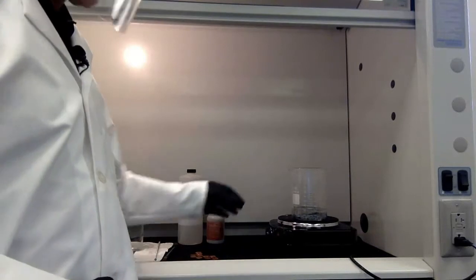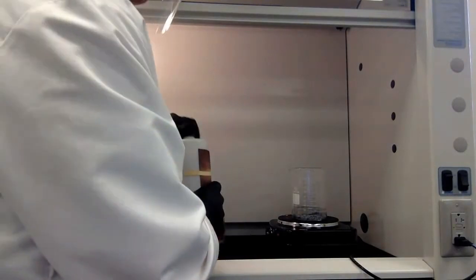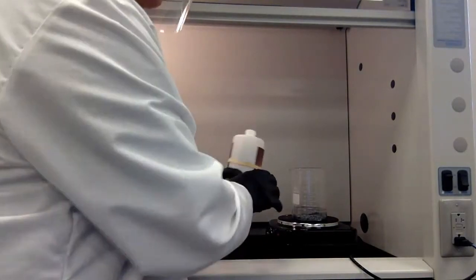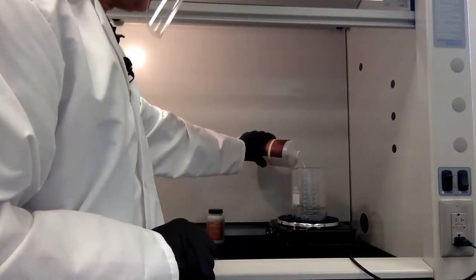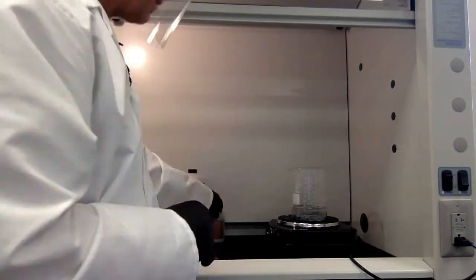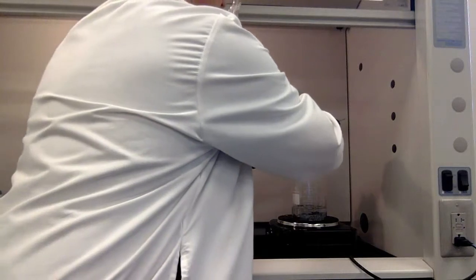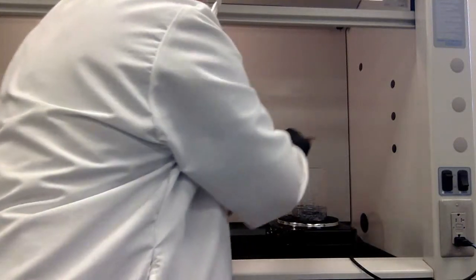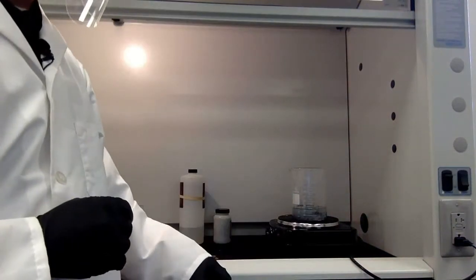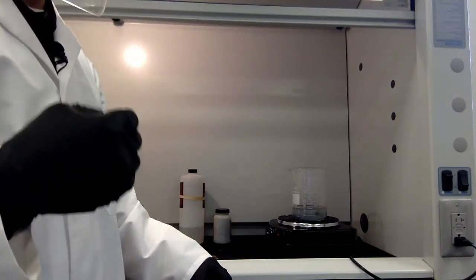To begin, I've got a large beaker here set up, and I'm just going to put a little bit of water in there, and I'm going to add some sodium hydroxide solution to it. And that's plenty. I'm going to add some zinc powder to it as well. And there we go. I'm going to allow that solution to heat a little bit. I don't want it to boil, I just want it to be hot, and that's going to allow my reaction to progress a little better.